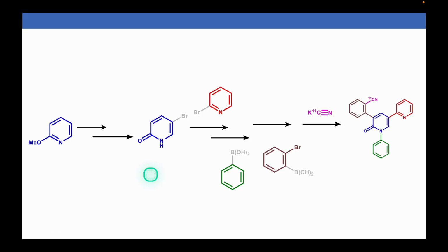This is achieved through a series of coupling reactions using commercially available starting materials. In the final step of the synthesis, carbon-11 is incorporated into its nitrile group. Given the short half-life of carbon-11, which is approximately 20 minutes, it is therefore considered most practical and convenient to incorporate it during the very last step of the synthesis, as we will see later.